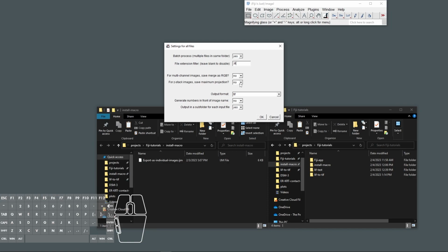Here we're also probably going to say no, because if you want to do this, you can do it quite easily at a later step. But down the road, in the same video, I will show you that if you do this, it's perfectly fine. Output format, we're going to leave that as TIFF, and we're going to leave everything else here no, and this is up to you. I'm going to say no for now.